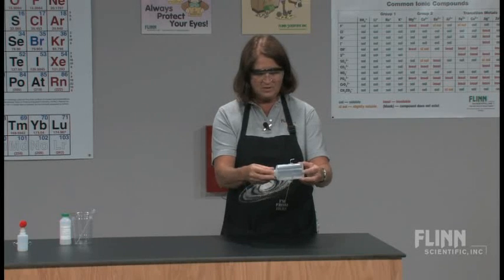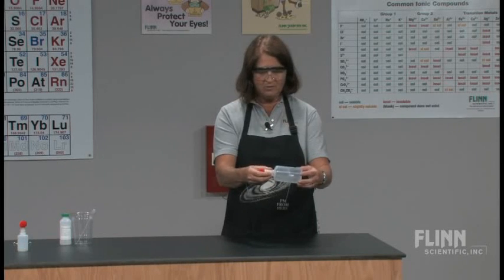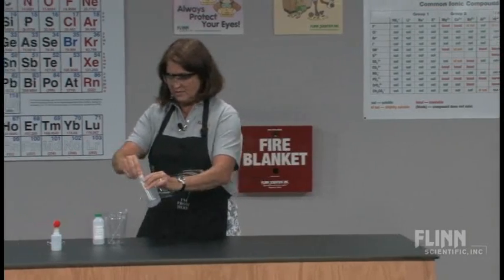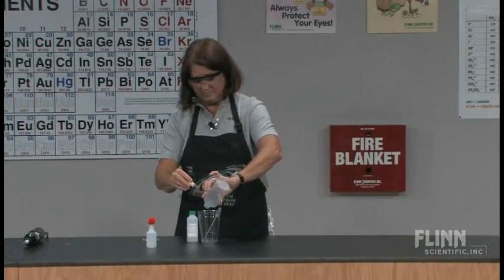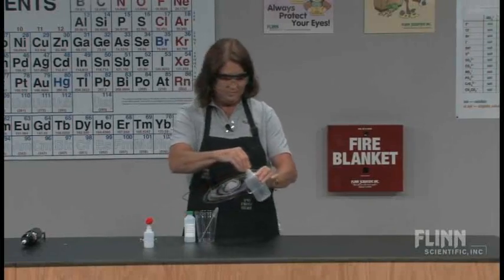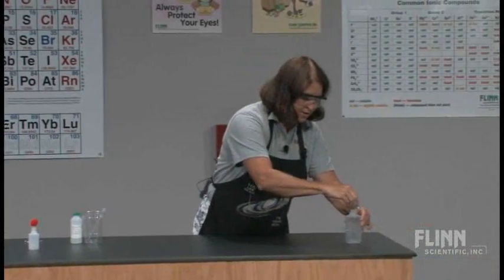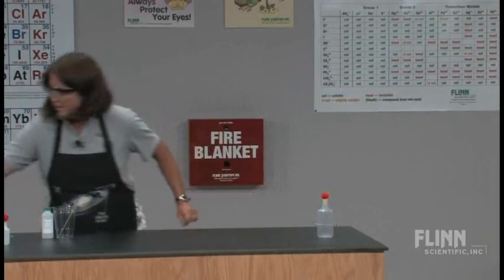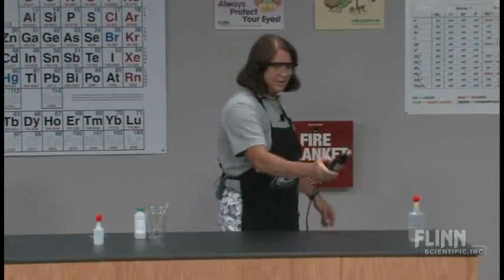You don't want to waste your supplies of any chemical in the stock room. Let's pour this out. You don't have to insert the stopper hard at all. If you want to cover your ears again, here we go.